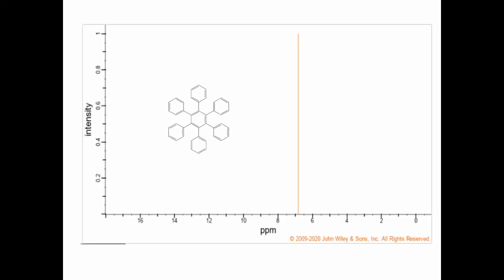The same thing occurs with the NMR. Once we lose the double bonded oxygen, once we lose the ketone, the entire molecule becomes incredibly symmetrical, where all of the hydrogens are almost exactly the same. Remember that in a hydrogen NMR, when we look at benzene rings, the signal we'll get is usually somewhere around 7, which is this line here.